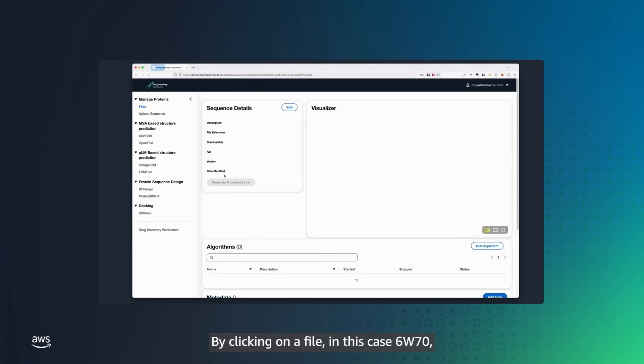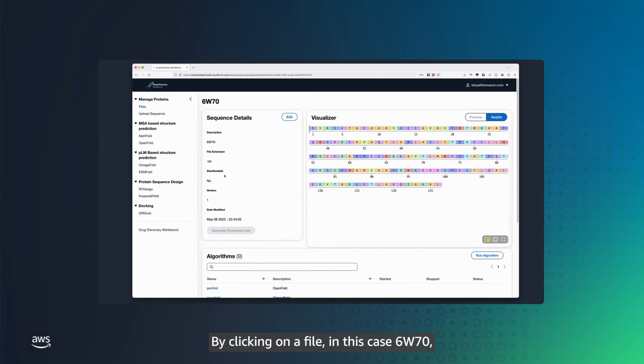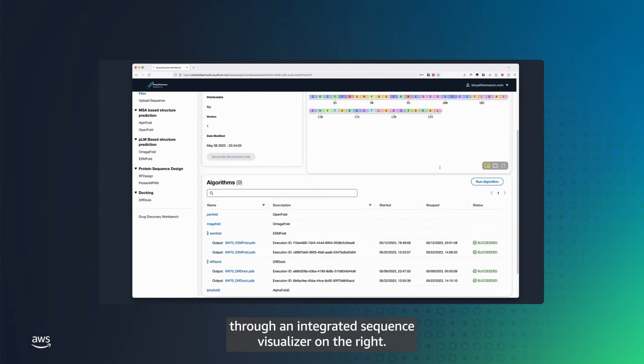By clicking on a file, in this case 6w70, you can now see the sequence information through an integrated sequence visualizer on the right.